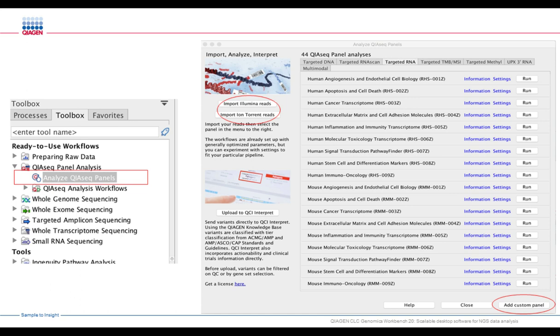In the biomedical genomics analysis plugin there's also a launch facility for Qiagen panel analysis. There are seven or eight tabs for different types of Qiagen panels — some are for DNA, others for RNA, and the newest one is multimodal, targeting both RNA and DNA. These work with Ion Torrent data as well as Illumina data, and you can use catalog panels off the shelf or add custom panels designed with Qiagen GeneRead.